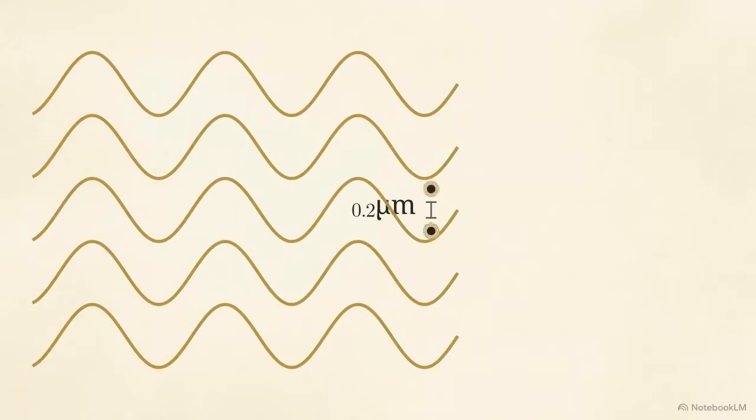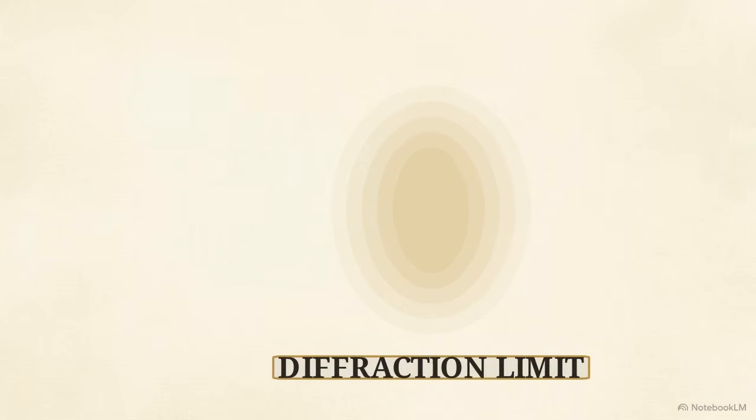Eventually, optical microscopes hit a physical wall. Visible light travels in relatively wide waves. When those waves try to pass through details smaller than 0.2 micrometers, they diffract and fail to resolve them. The wave itself is simply too big for the gap.